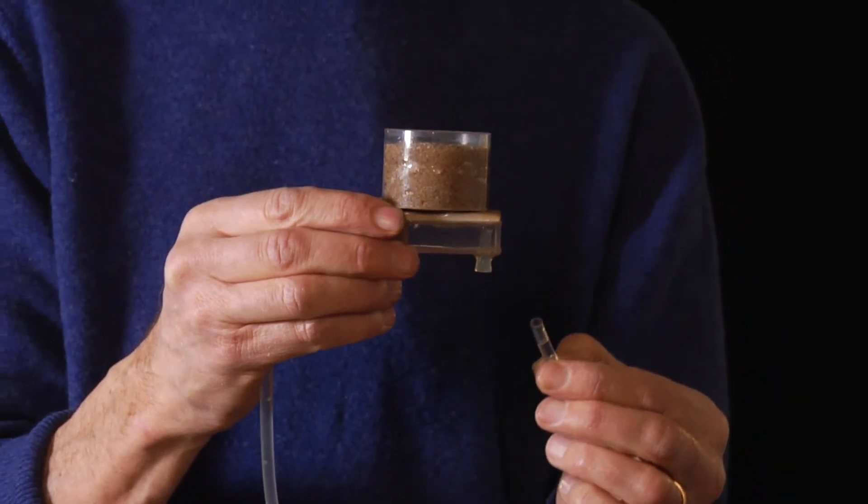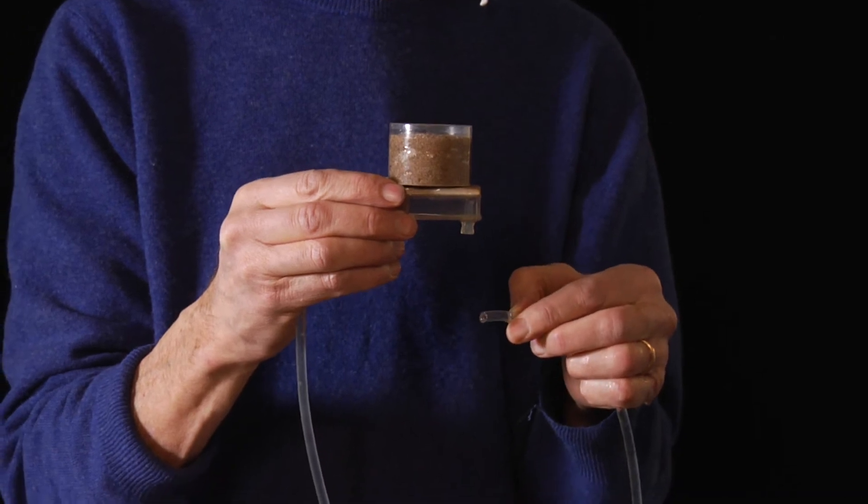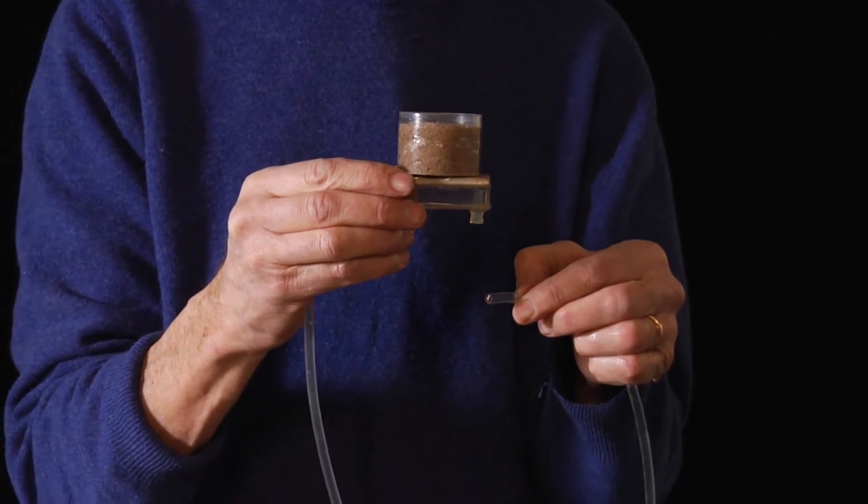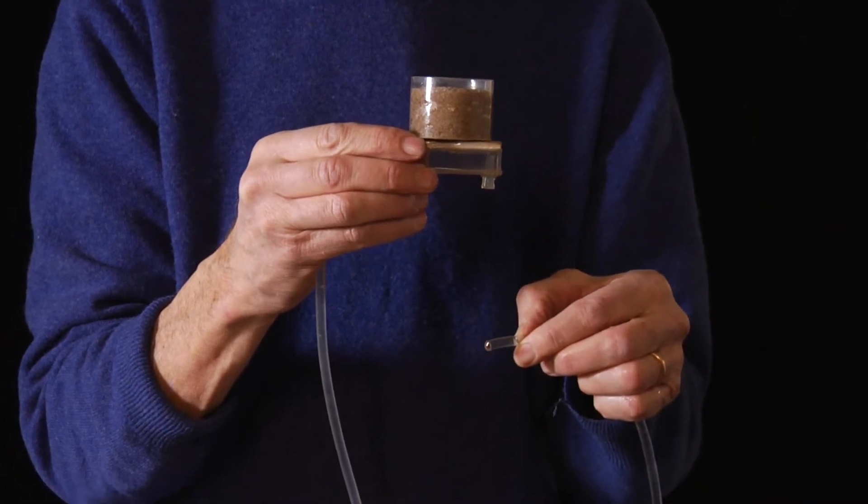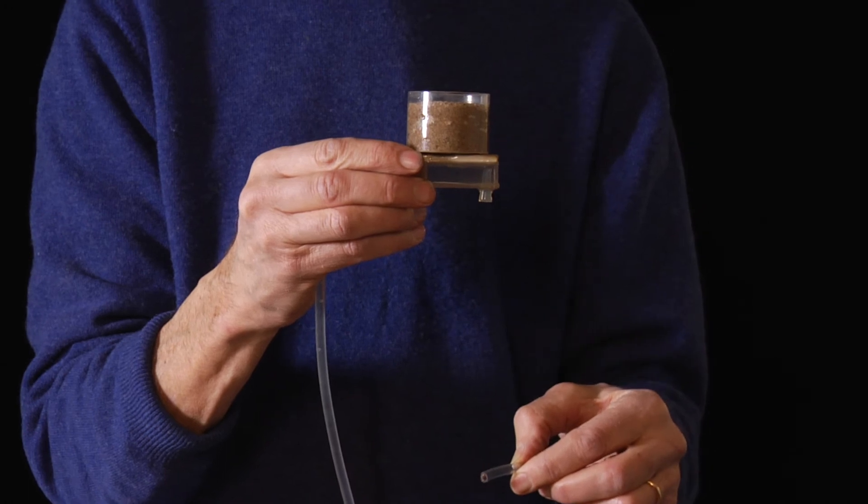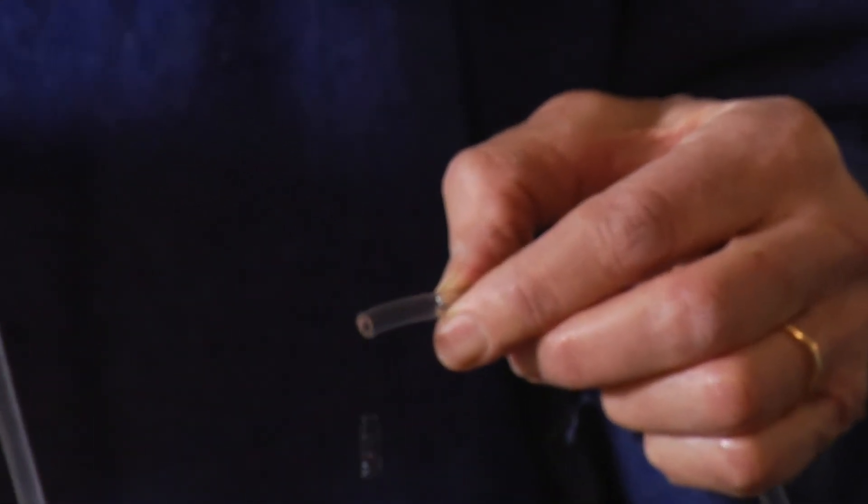I lower the tube, creating a negative pressure in the plate and in the soil. Now it's minus 5 centimeters and a single drop is falling. I lower it to 10, a few drops are coming. When I have lowered to 15, an intense dripping starts.